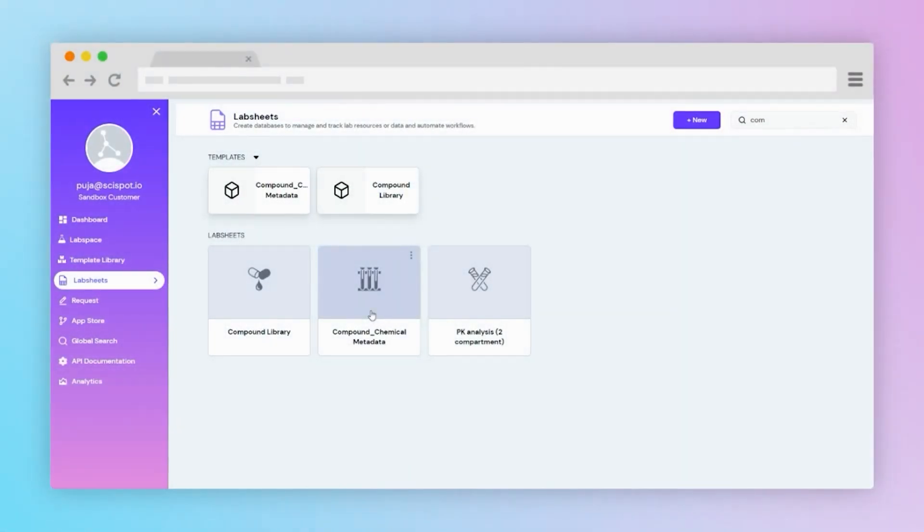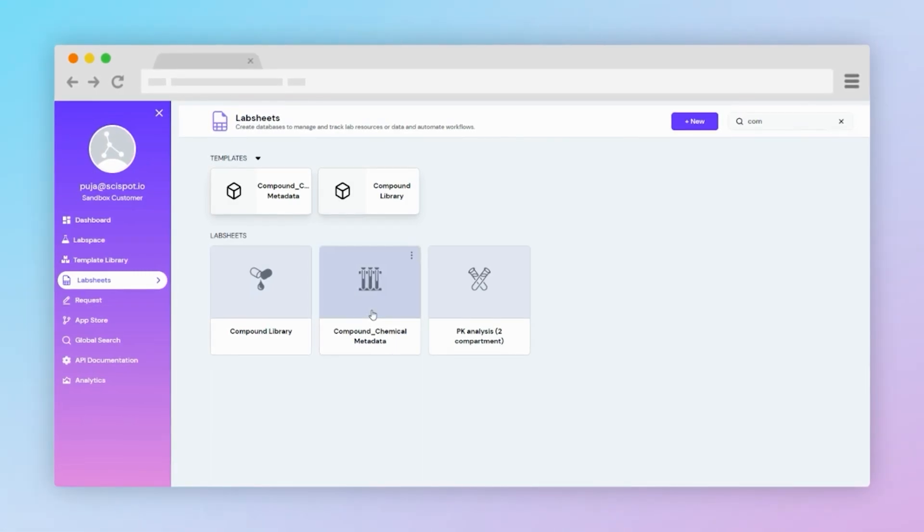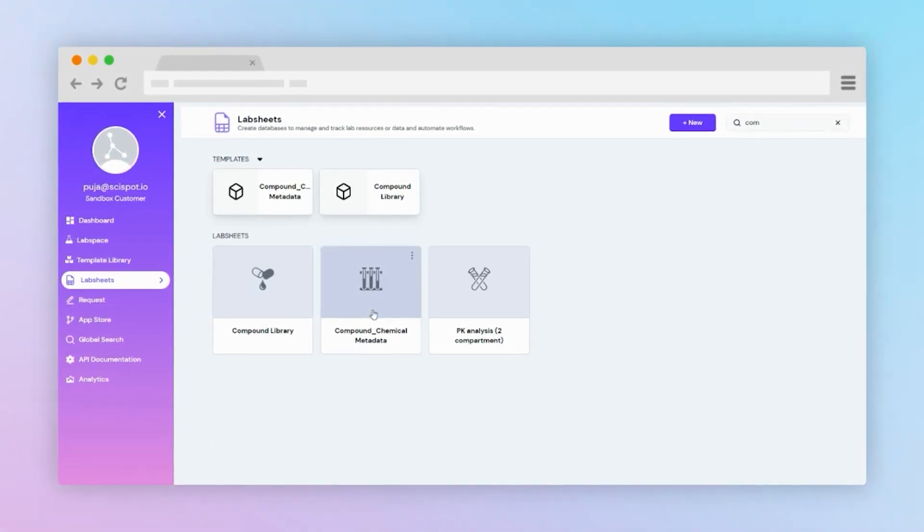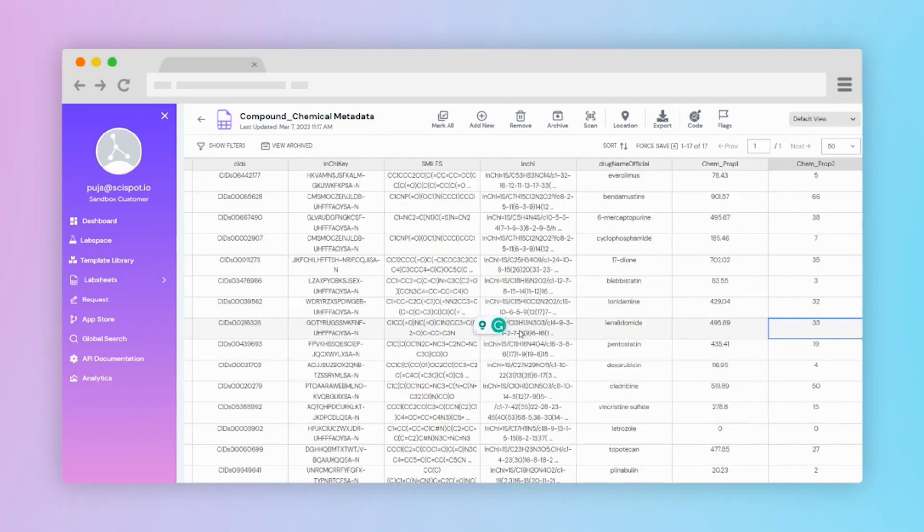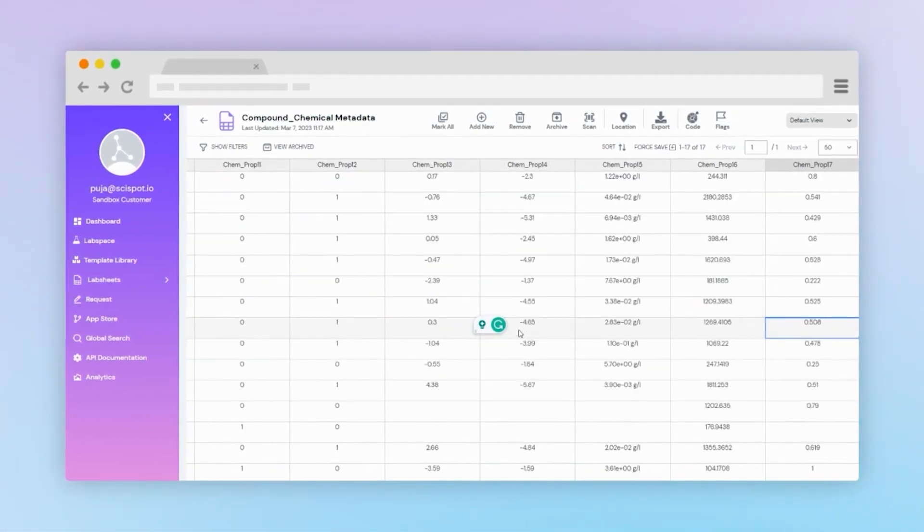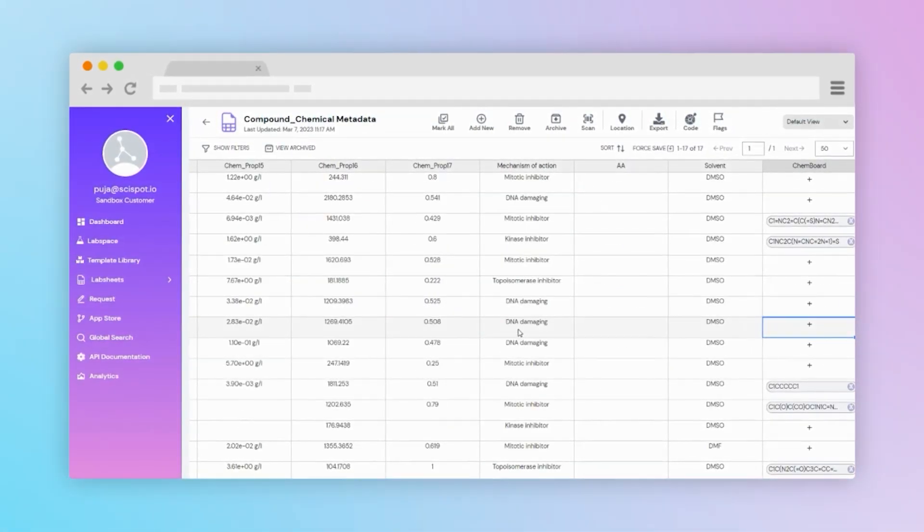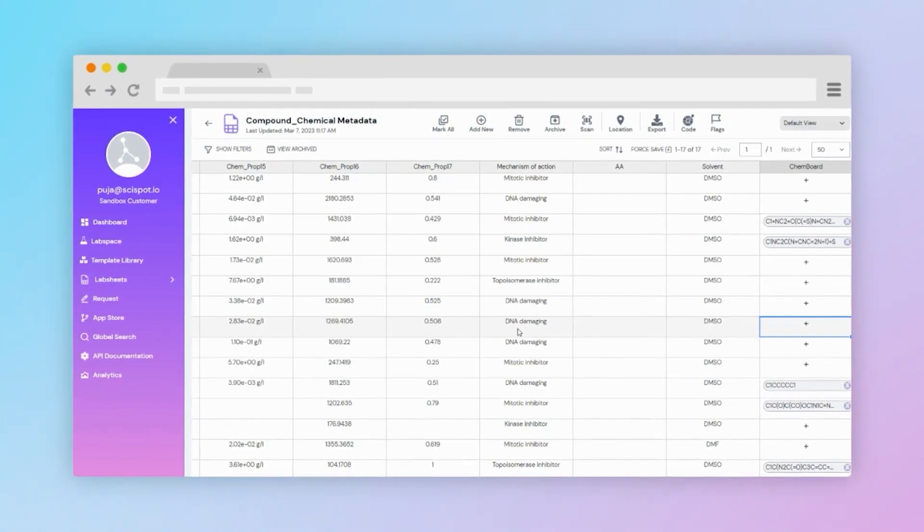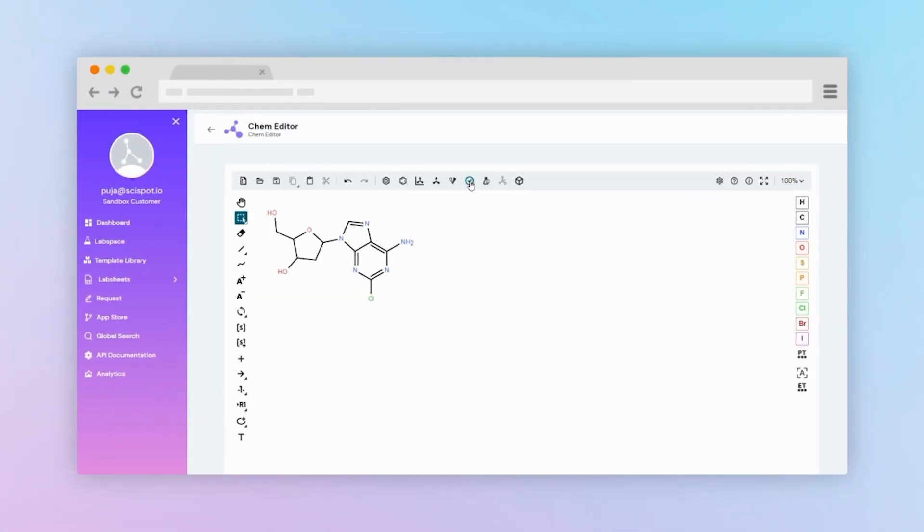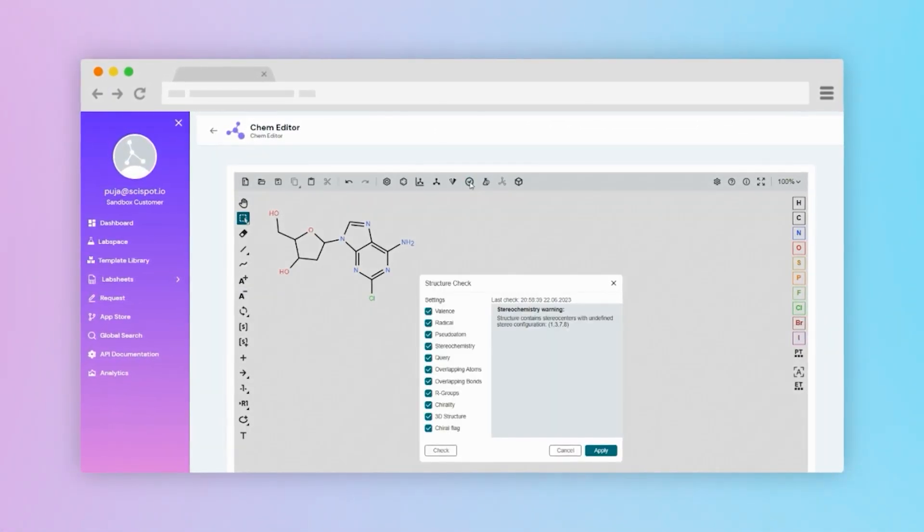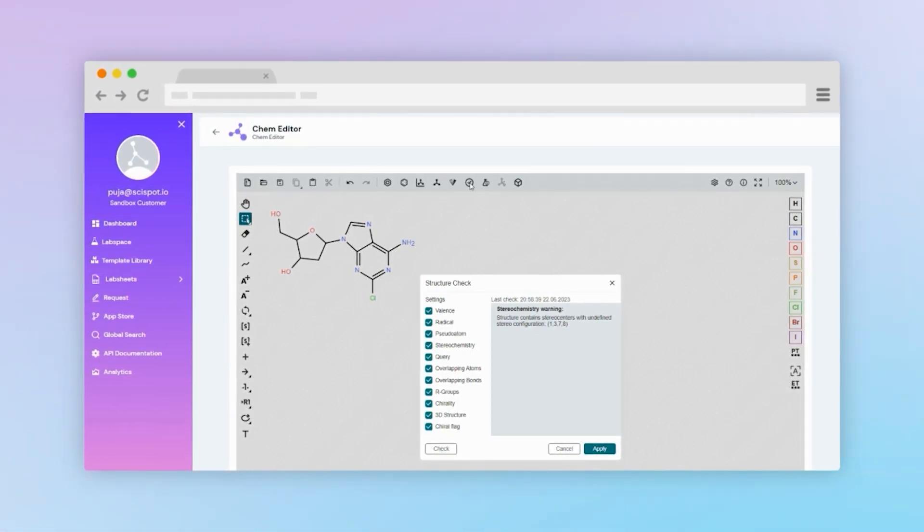We also have features in chemical structures. Let's go to compound metadata. Here you can store all your relevant metadata associated with chemistry and can visualize the structure by entering SMILE, MOL, or INCHE files. There are many more to it. You can learn about the stereochemistry of your structure too.